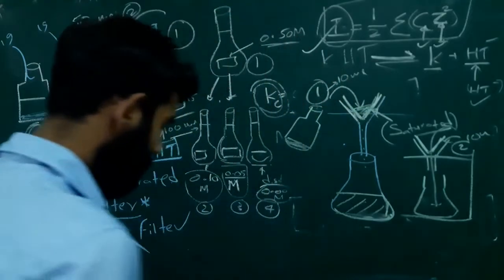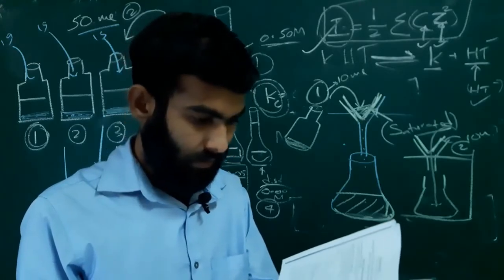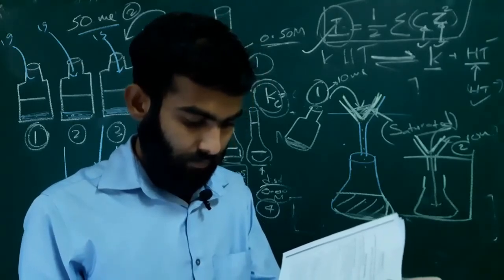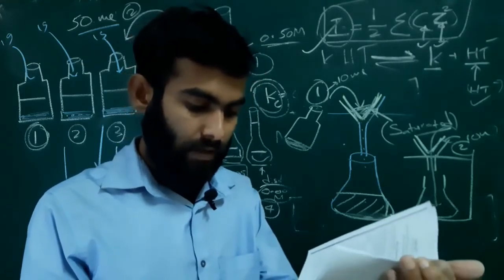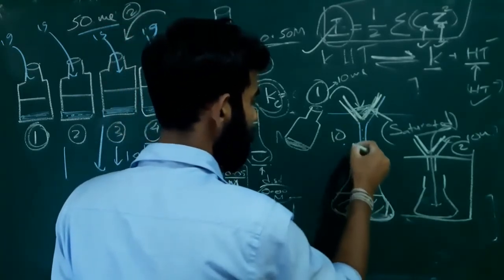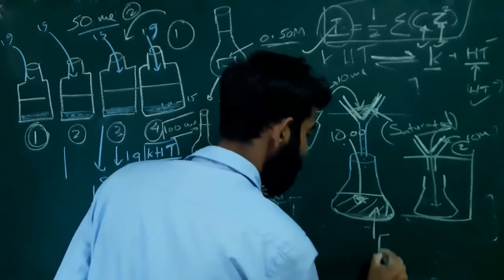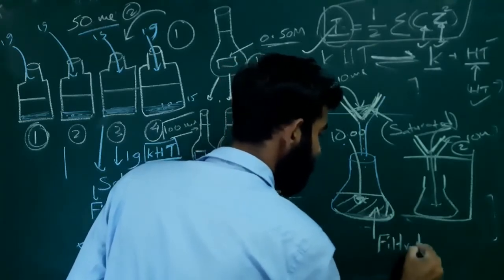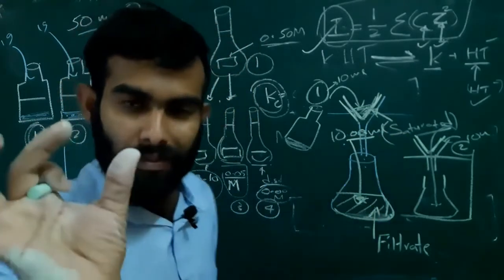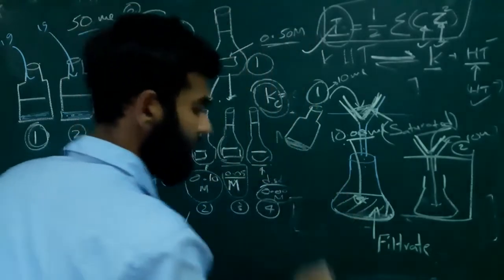After that, we will titrate. What is the volume? From the filtrate we will take 10.00 ml of potassium hydrogen tartrate solution. 10.00 means 2 decimal places, which means we have to use a graduated pipette or a 10 ml pipette. So we will take a 10 ml pipette.